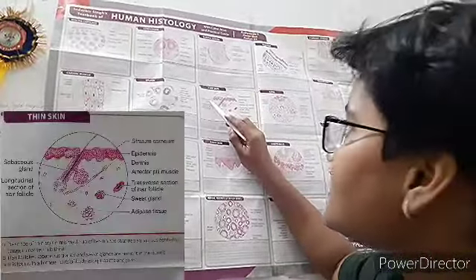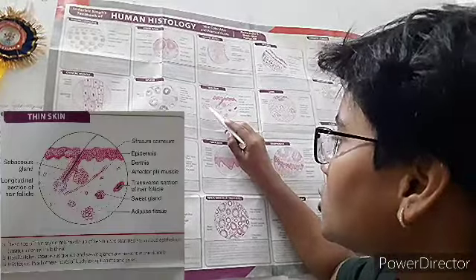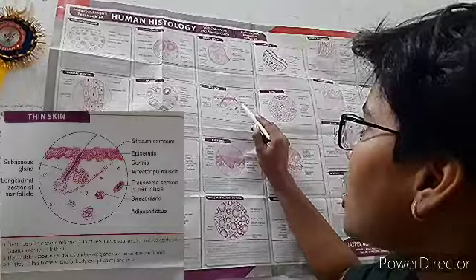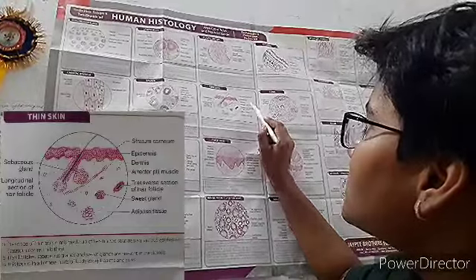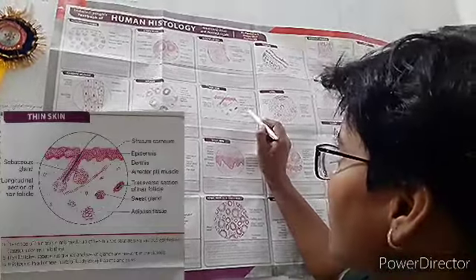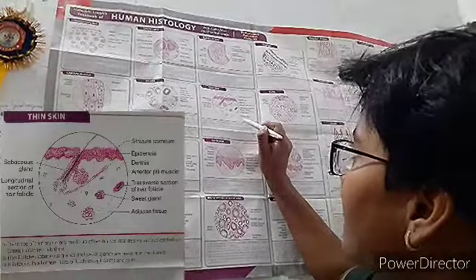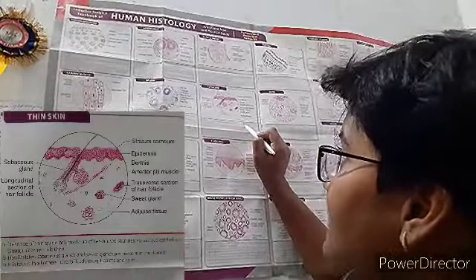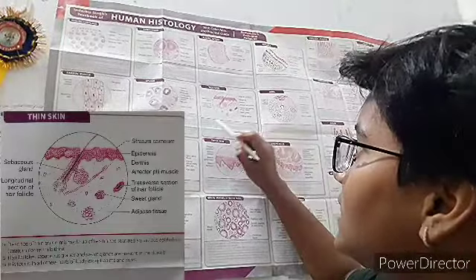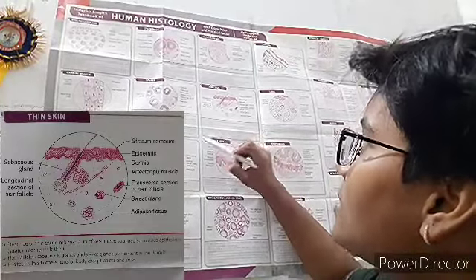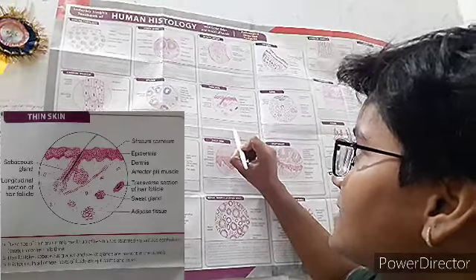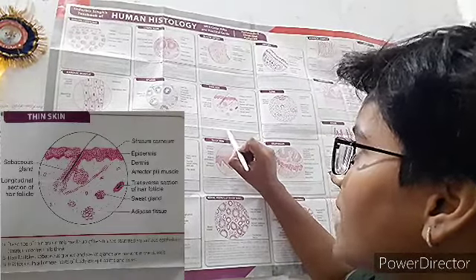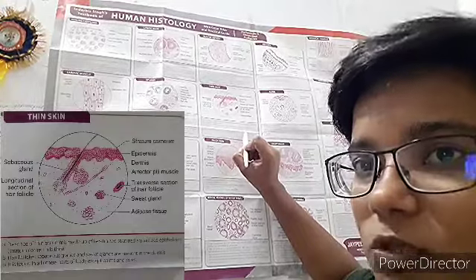Now thin skin. Visible structures include sebaceous gland, longitudinal and transverse sections of hair follicles, stratum corneum, epidermis, dermis, arrector pili muscles, sweat glands, and adipose tissue. Thin skin has a thin epidermis made up of keratinized stratified squamous epithelium, and the stratum corneum is thin. Hair follicles, sebaceous glands, and sweat glands are present in the dermis. Thin skin is found in all other parts of the body except palms and soles.